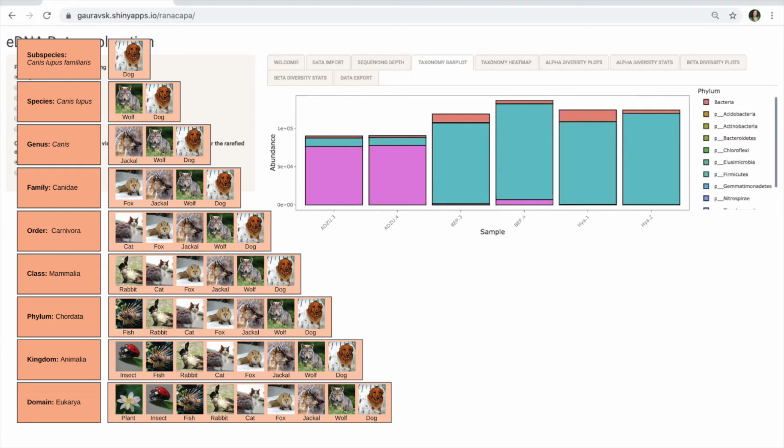So for our data here, we sequenced a part of the DNA of bacteria, and part of what we did in DNA Subway was to then group those sequences that were similar to each other and then reference them to a database that would tell us how similar they are to other organisms.